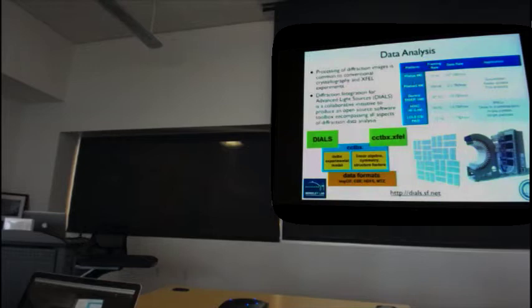If you look at the detectors that are either being used or on the horizon, there are a lot of pixel array detectors. All of these are from Dectris, a Swiss company. Those current detectors can generate half a terabyte an hour. The next generation is generating maybe 2 terabytes an hour because they frame at a higher rate. The next bigger set of detectors, 10 terabytes an hour. This is very similar to the kind of data rates that we actually have at the FELs, because they're running, you can see, potentially at similar framing rates. So this is the CSPAD at LCLS, and ADSC is developing another pixel array device. So the demands on data processing from synchrotrons and FELs are in a sense converging.